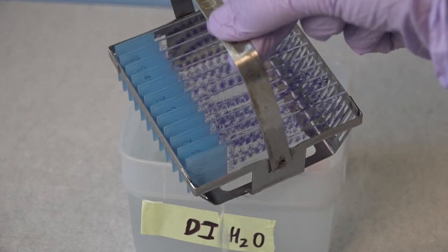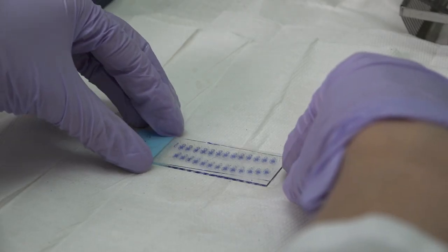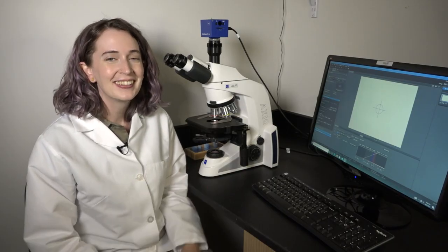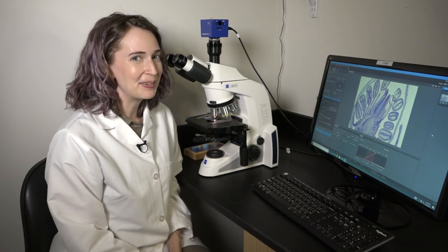They're so beautiful. After a few more chemical baths, I glue down a glass cover slip to protect the sections, and then let everything dry. And now, the moment of truth. Let's pop them on a light microscope and see how they look. Yay, it's a flower bud. Oh my gosh, I'm so happy with how this turned out.